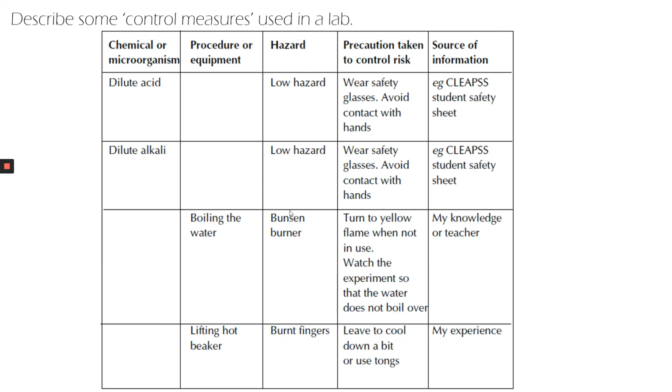We have control measures in a lab. This includes everything from appropriate handling techniques, protective clothing and PPE, equipment, and aseptic techniques. We should also consider using the smallest effective masses, volumes, and concentrations of dangerous chemicals and limiting the length of exposure we have to that hazard.